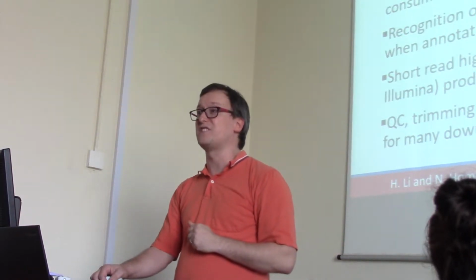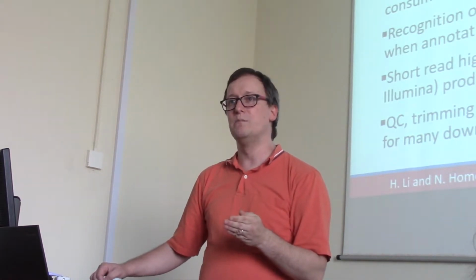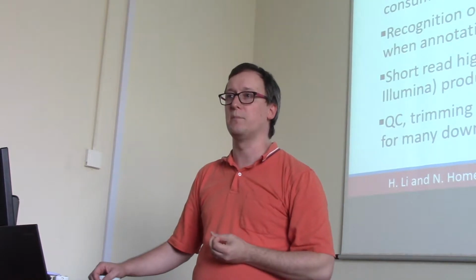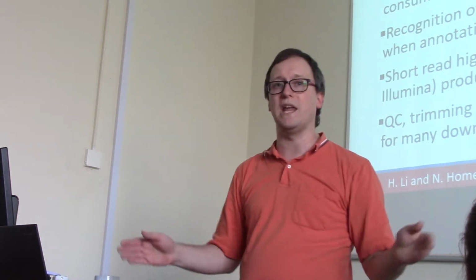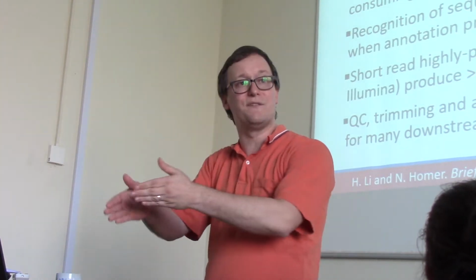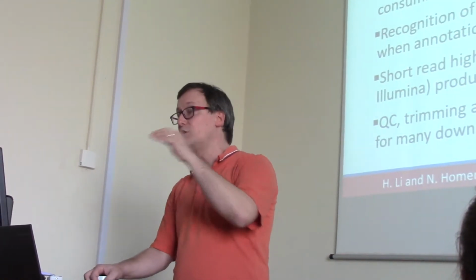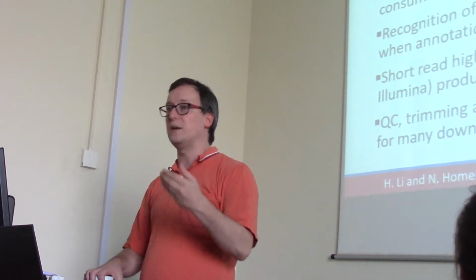We also have this kind of time game. Having even a few massively parallel sequencers around means that you're going to be playing catch-up all the time, trying to accommodate and trying to understand all the data that these instruments can create. If you are using your instrument one day a week and spend the rest of your time playing catch-up on your computer, that's a really bad scenario, because it means that an expensive instrument is lying idle because you haven't got enough computer people, basically. So if you can instead use alignment, you can have a much faster analysis of the data from the sequencer than if you attempt to do a de novo assembly.